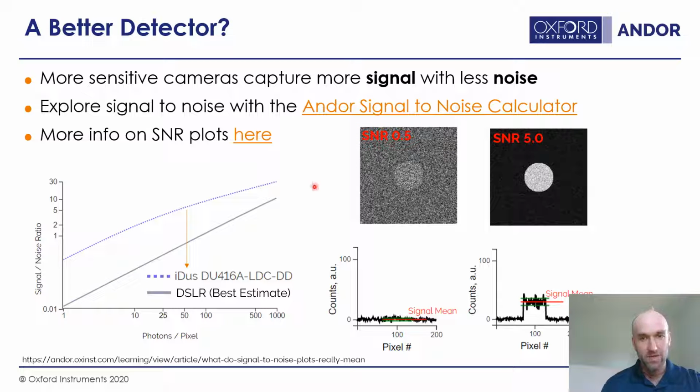So the EOS camera, say at this fairly low light level, might have a signal to noise ratio of 1/2. And that doesn't mean that you can't see anything. It just means that it's really hidden in the background. So this is our dark current coming in here due to the uncooled sensor. Whereas under the same conditions, we might get something that looks more like this with the iDus spectroscopy camera. So that's kind of the difference. That's a really rough illustration of the difference between using a consumer-grade DSLR and a purpose-made spectroscopy camera.